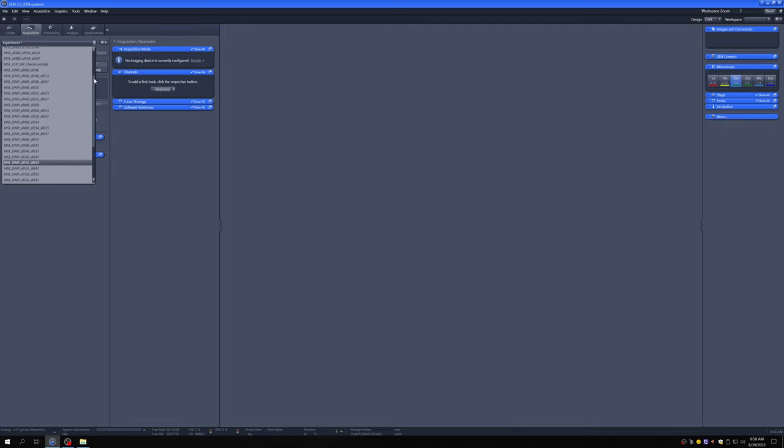So for example, this particular sample that I have on now has DAPI, alexafluor 488, and a fluorophore that's very similar to alexafluor 594. So that is the setting that I'm going to load by clicking here.